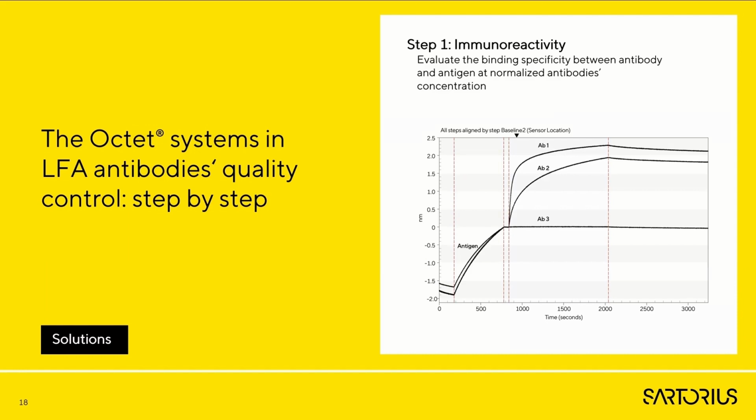Antibodies 1 and 2 bind to the immobilized antigen specifically, with antibody 1 showing a faster binding to antigen than antibody 2. Antibody 3 did not bind to the immobilized antigen, which is indicated by a flat, stable binding rate.